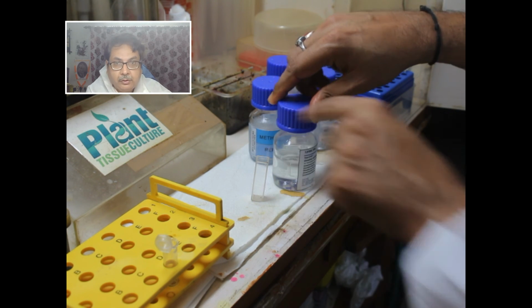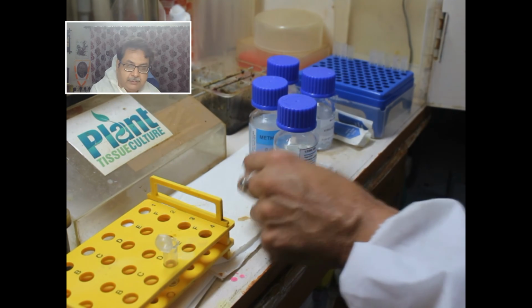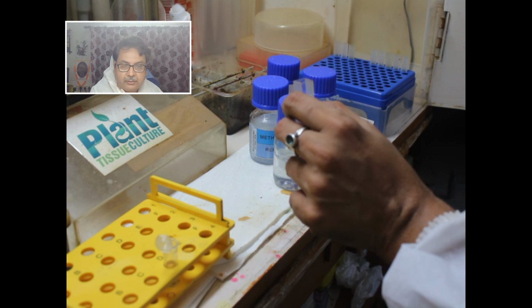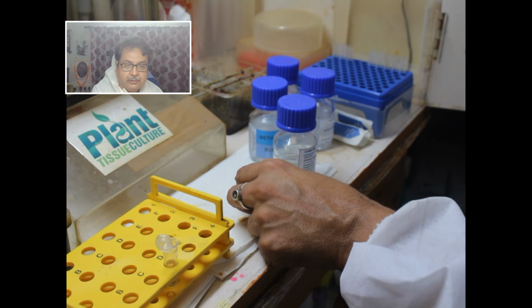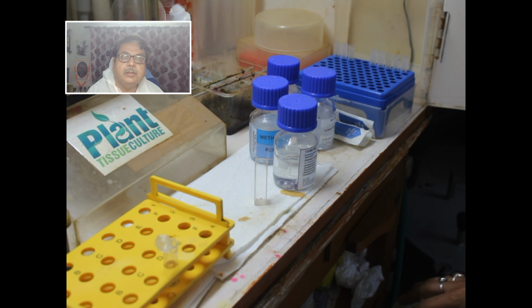Then it will go to the UV spectrophotometer. Simply take up the solution with a cuvette and put it into the spectrophotometer for a UV scan, getting the spectrum or the lambda max of the mycotoxins. So this is the end of the video. Thank you very much for watching it.